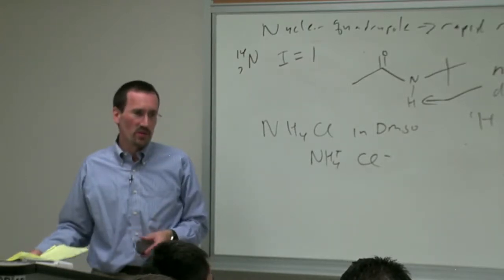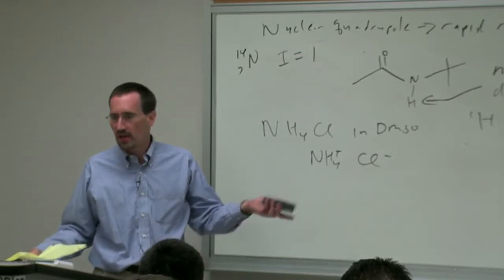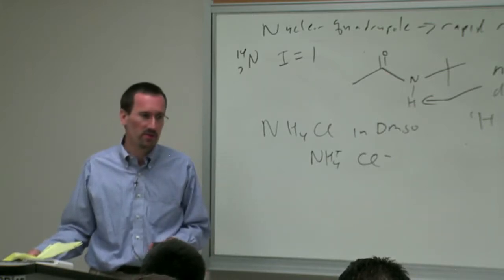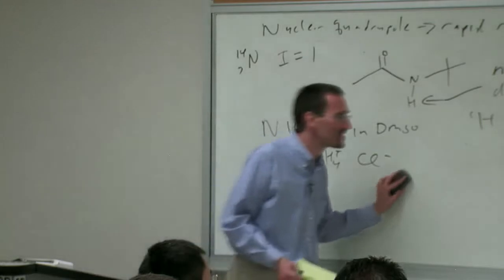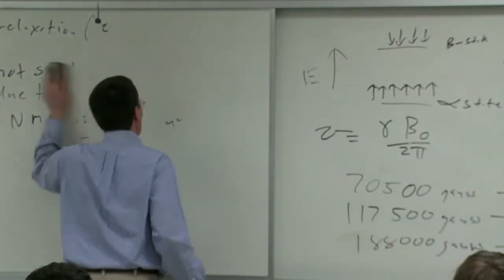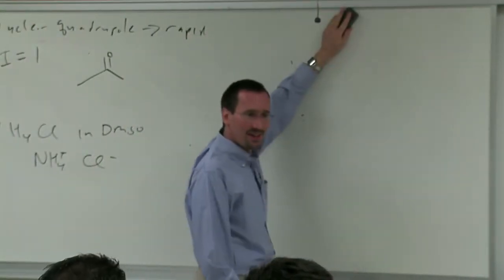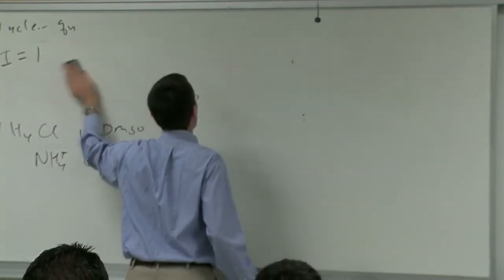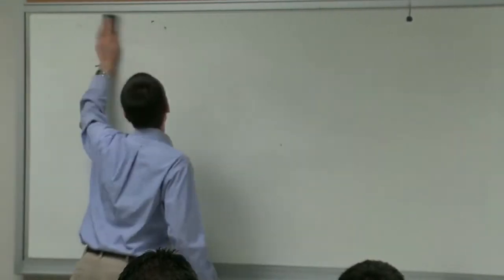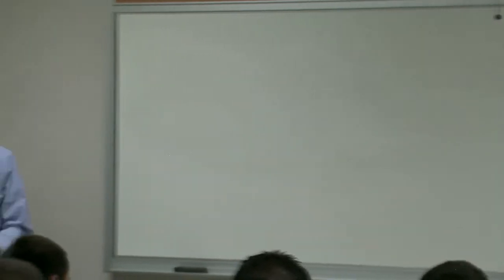And the limits on commercial instruments these days are about 900 megahertz, and the thing costs, I guess ours cost about, for the whole thing, about $2.5 million. And by the time you're at 900 megahertz, it's many, many millions of dollars. And there may be 1 gigahertz out there. It's in France or something. I think so. We really seem to have just pushed the limits of technology for how much electricity you can put in a superconducting coil without it just ripping itself apart.